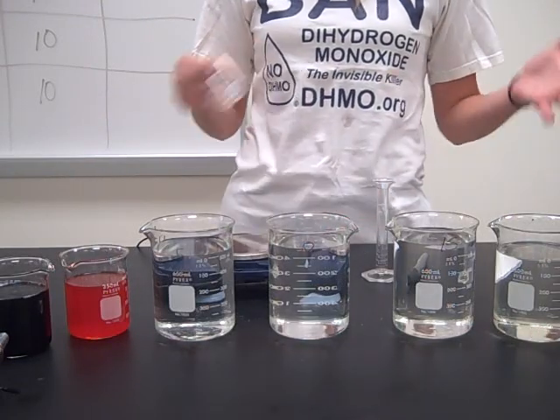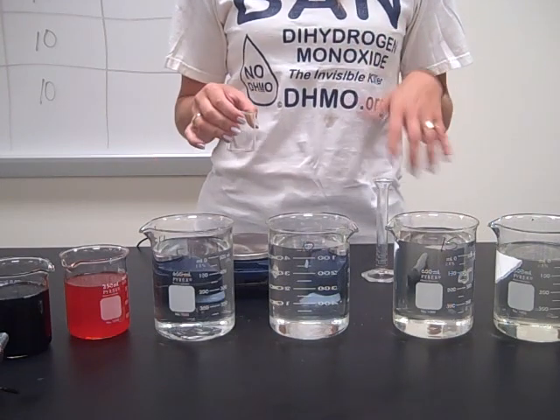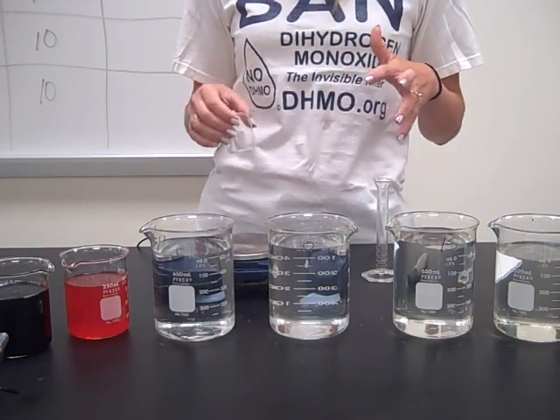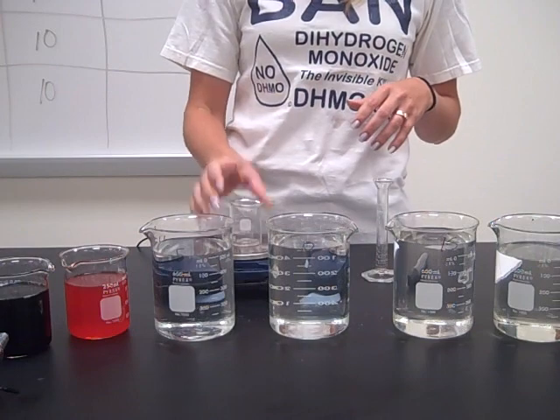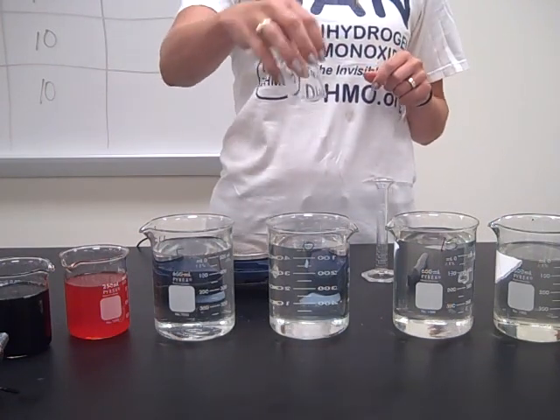Okay, so here is your pre-lab slash lab for those of you that are absent for the density of beverages and stuff. So first thing we're going to do is we need to tear out or zero out the mass of what we're going to use for our containment thing.